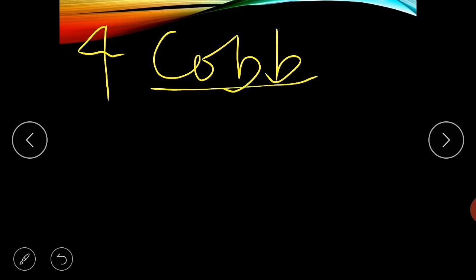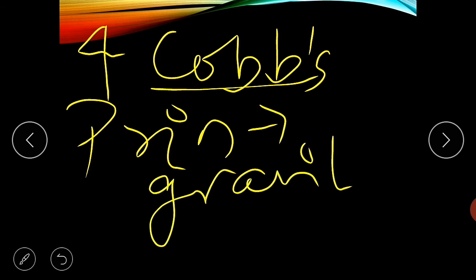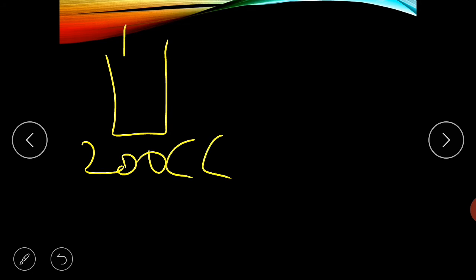Let's get into the Cobb's decanting and sieving method. Their principle is based on the differences in specific gravity. The soil particles and nematodes settle at different rates. First, we have to take pan 1. Thoroughly mix the composite soil sample. Take a soil sample of about 200 cc in pan 1. Next, add about 1 liter of water, stir well and break clots and clumps.